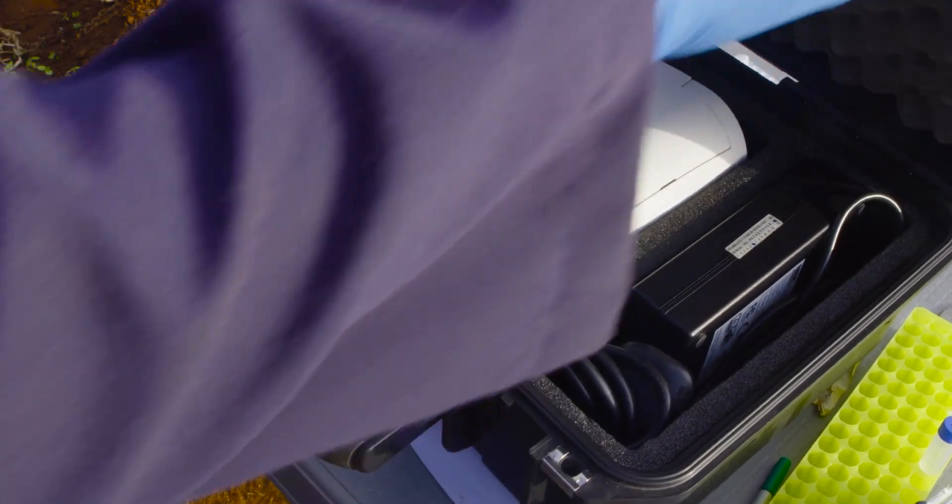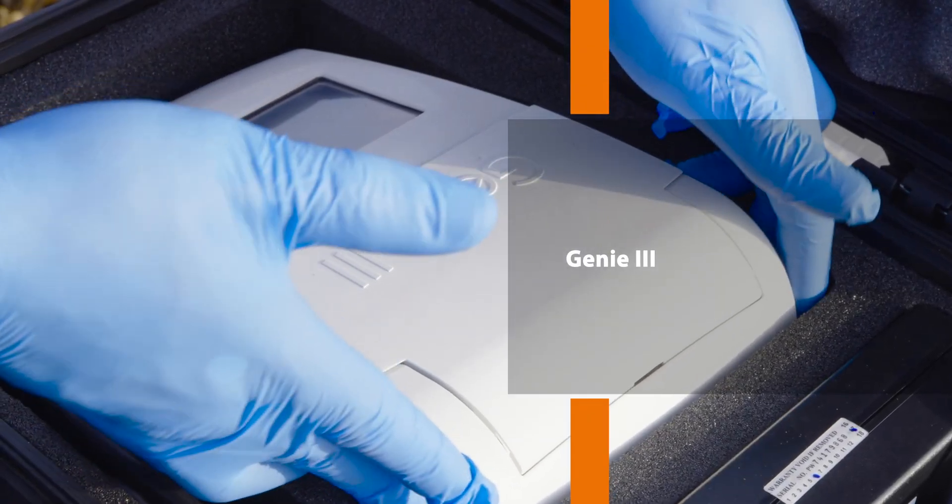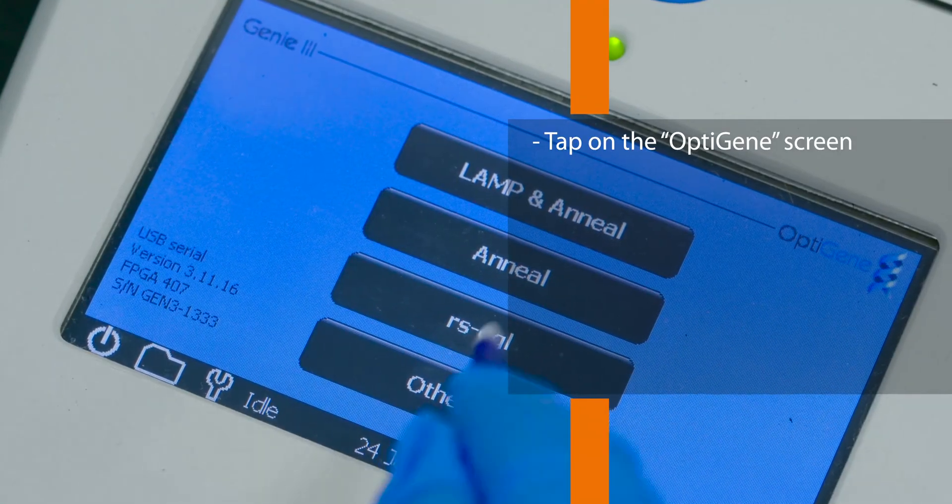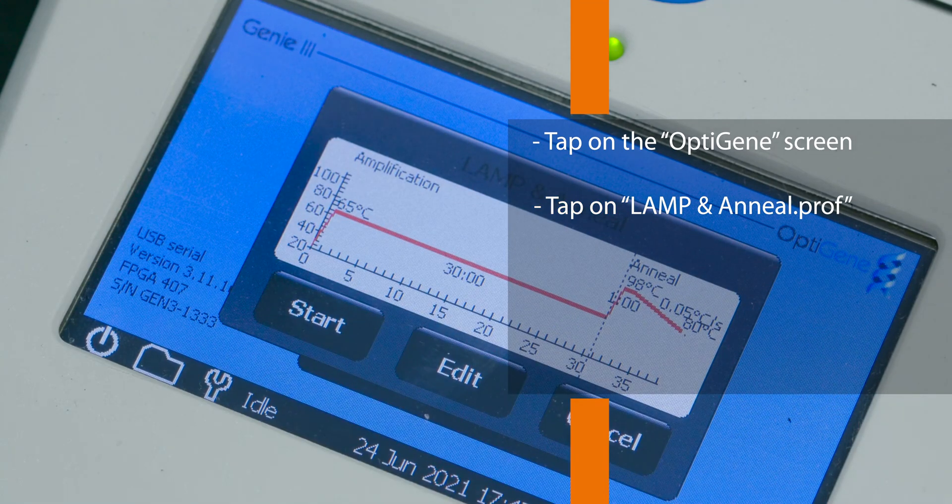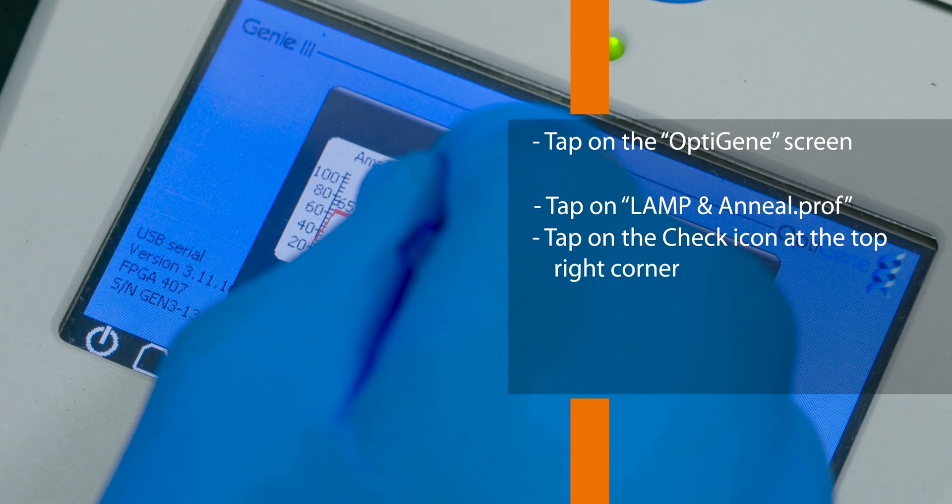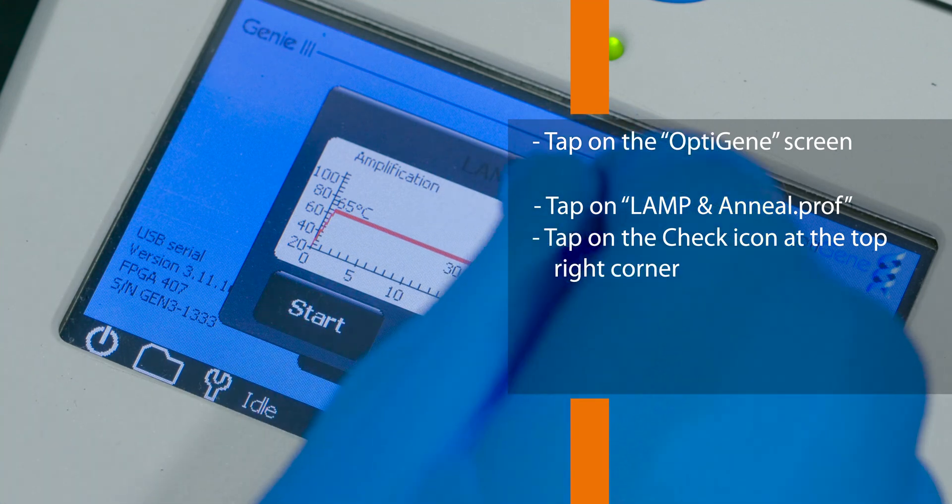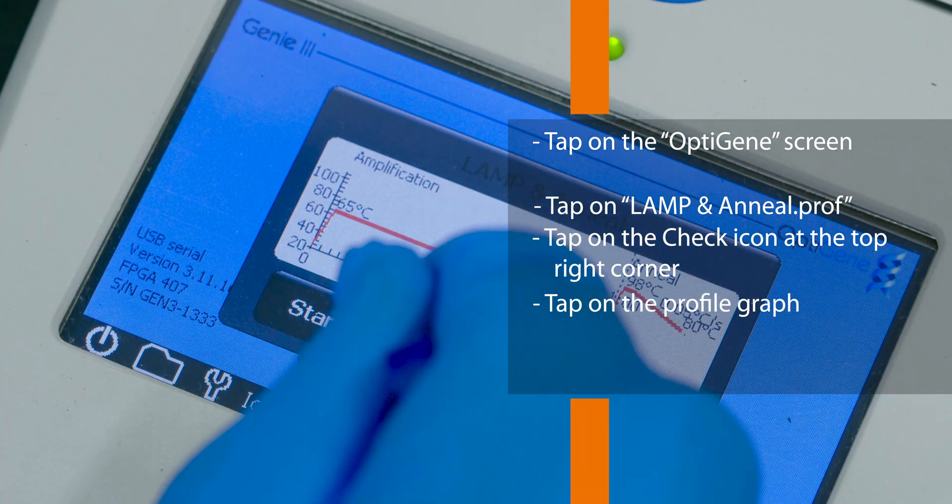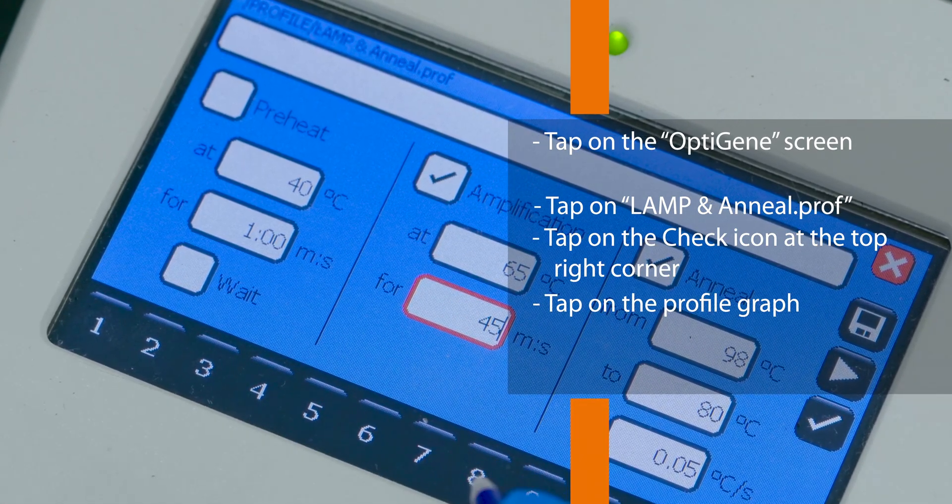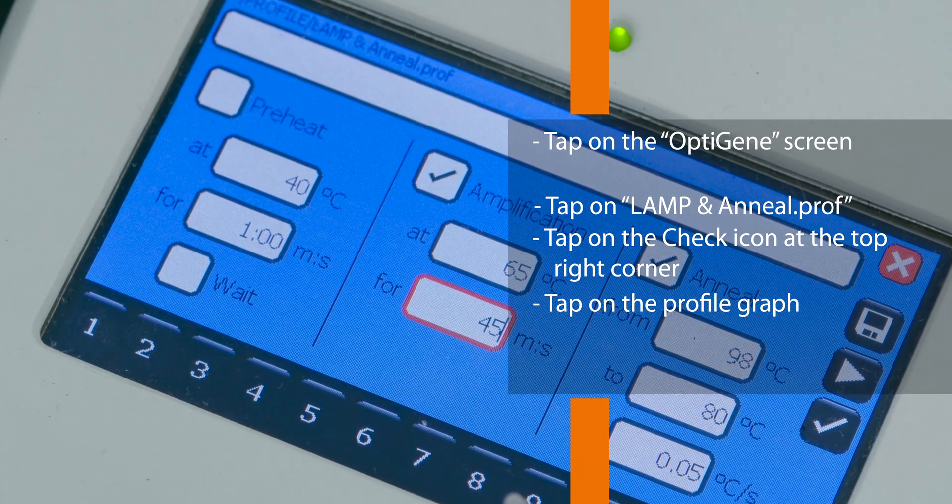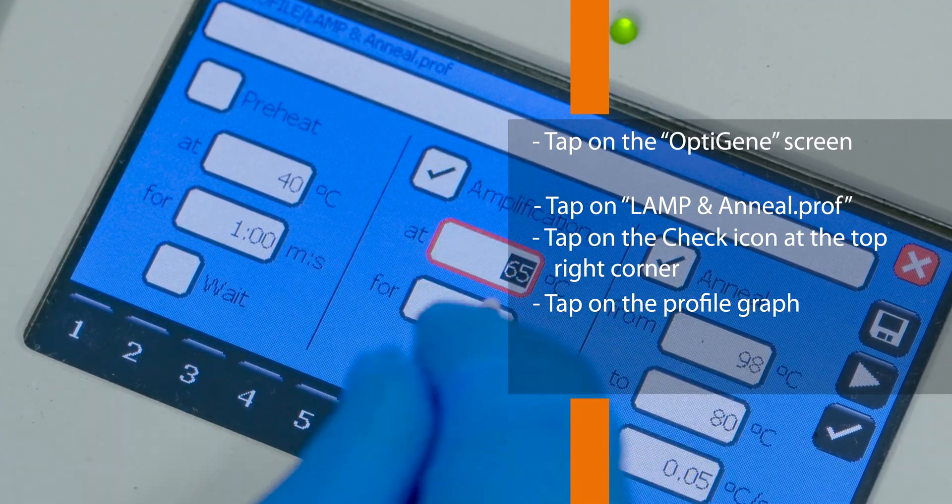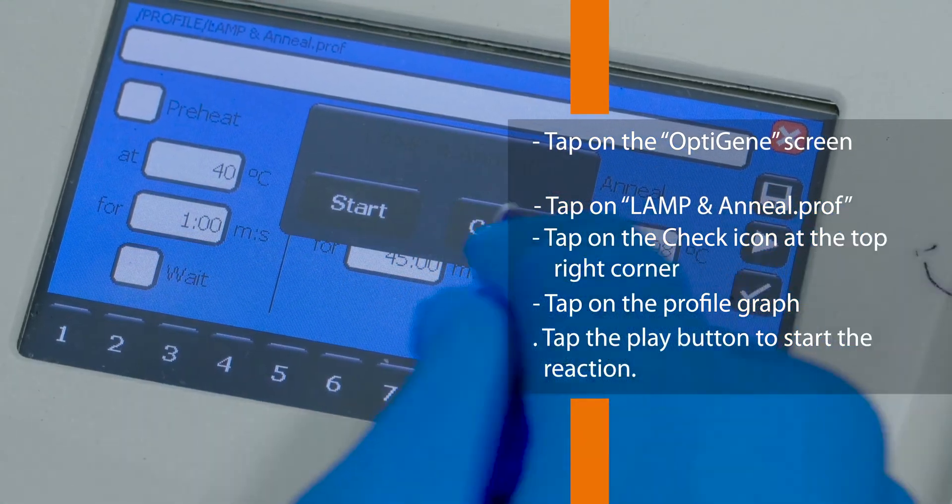Now, we'll share the steps to run a lamp assay on the Genie 2 and Genie 3 machines. Tap on the OptiGenie screen. Tap on Start. Tap on Lamp and Anneal.prof to write your own program as follows. Tap on the check icon at the top right corner. Select either of the A for the left or B for the heating block if using the Genie 2 instrument. Tap on the profile graph and set the amplification temperature at 65 degrees Celsius for Lamp 1 or 60 degrees Celsius for Lamp 2 but leave the anneal temperature at the default setting. Or tap on RSEGL. Tap the play button to start the reaction.